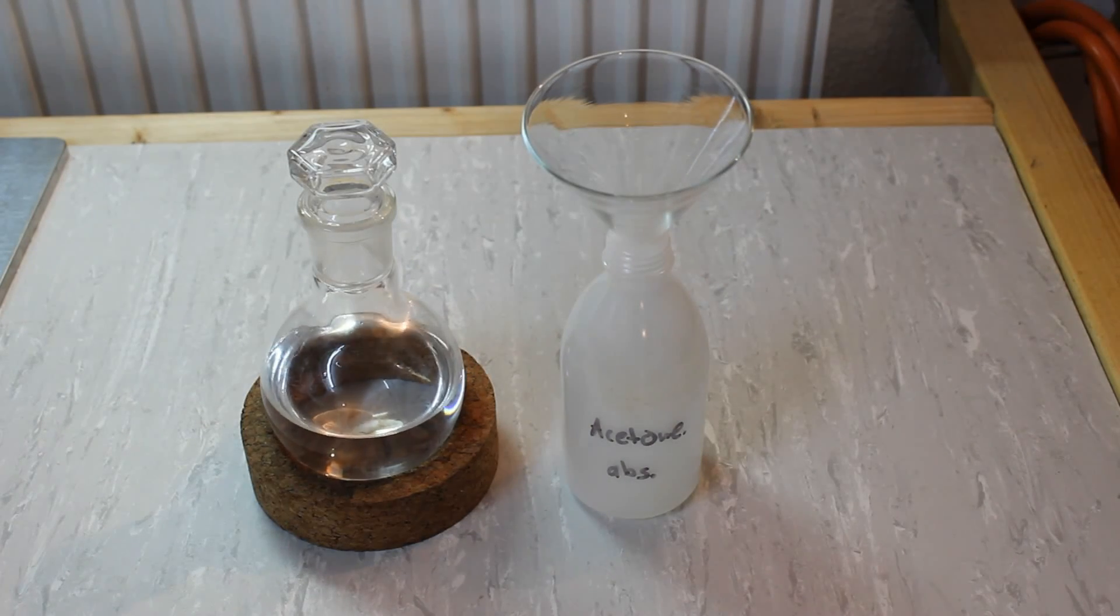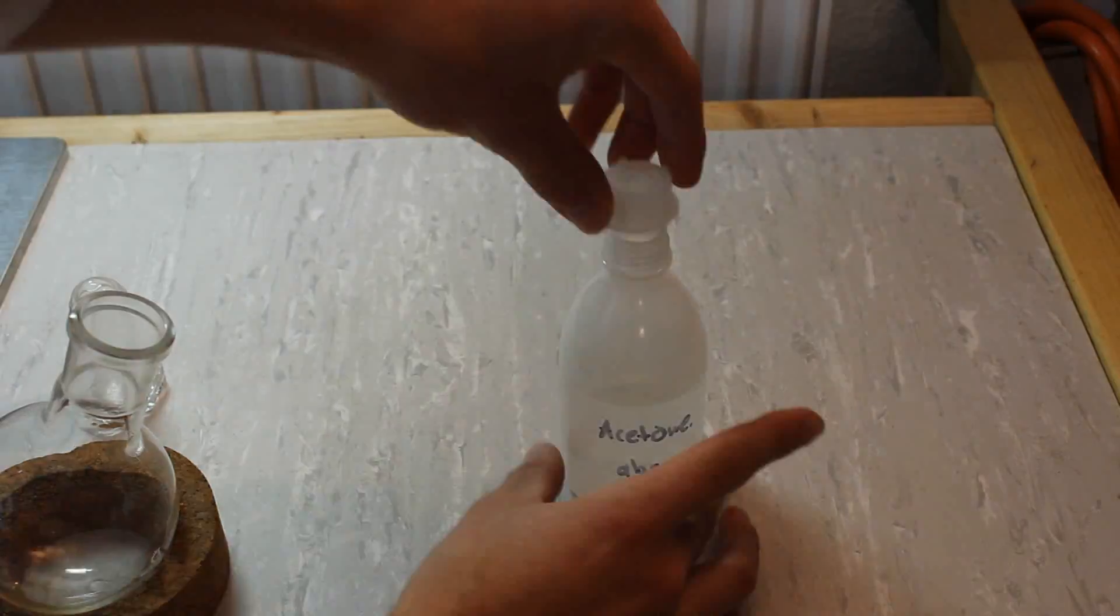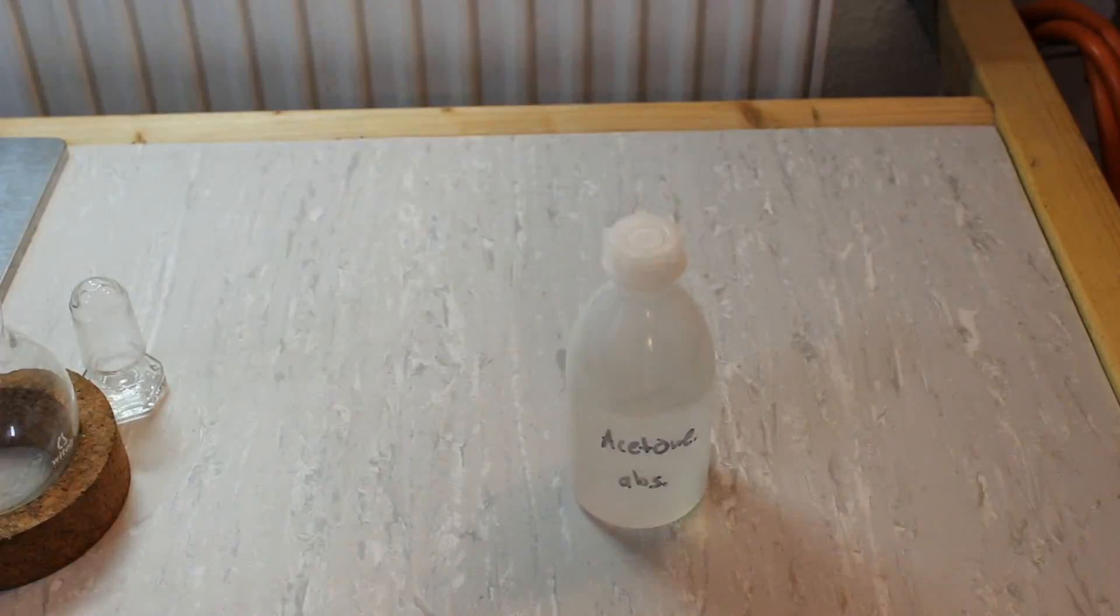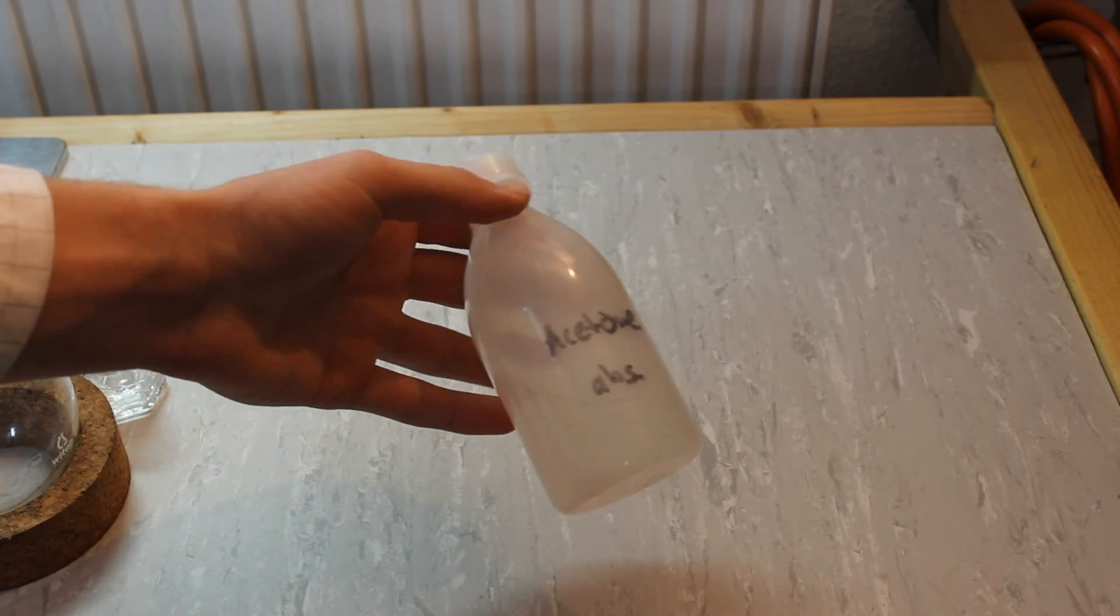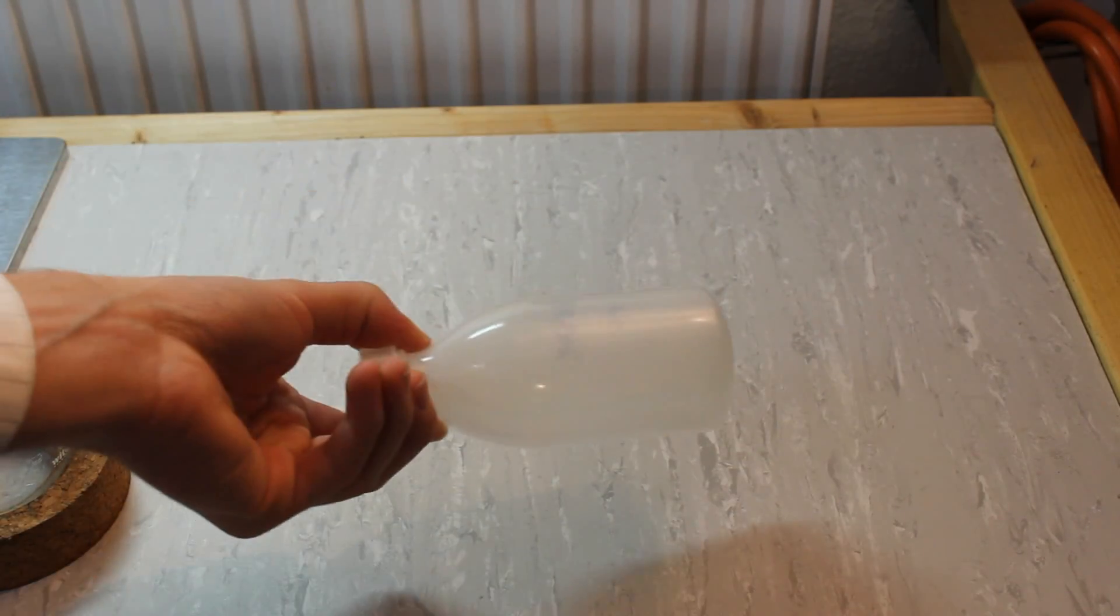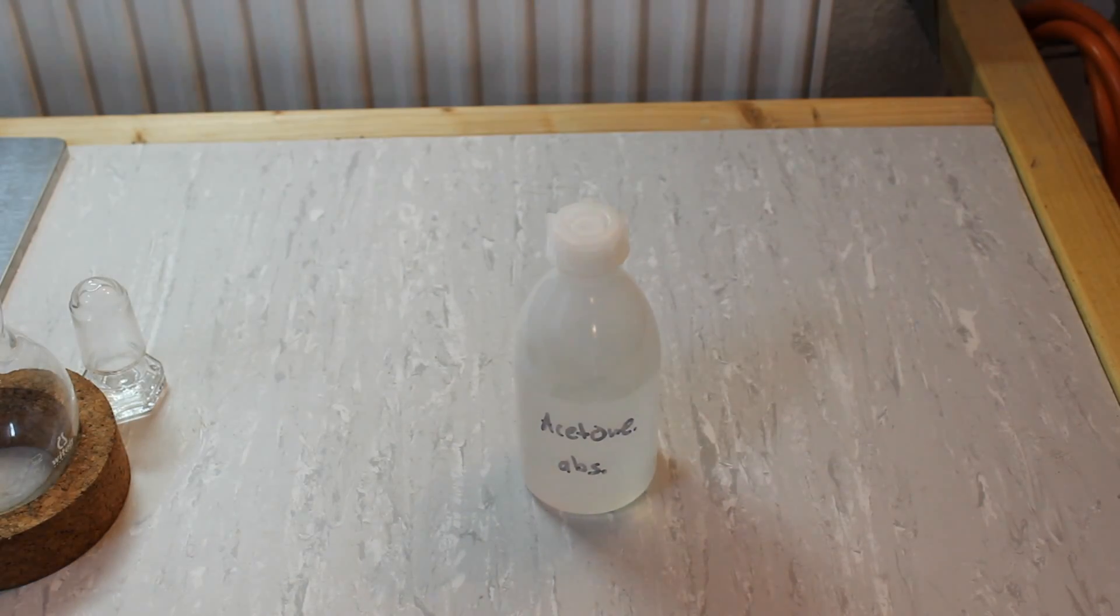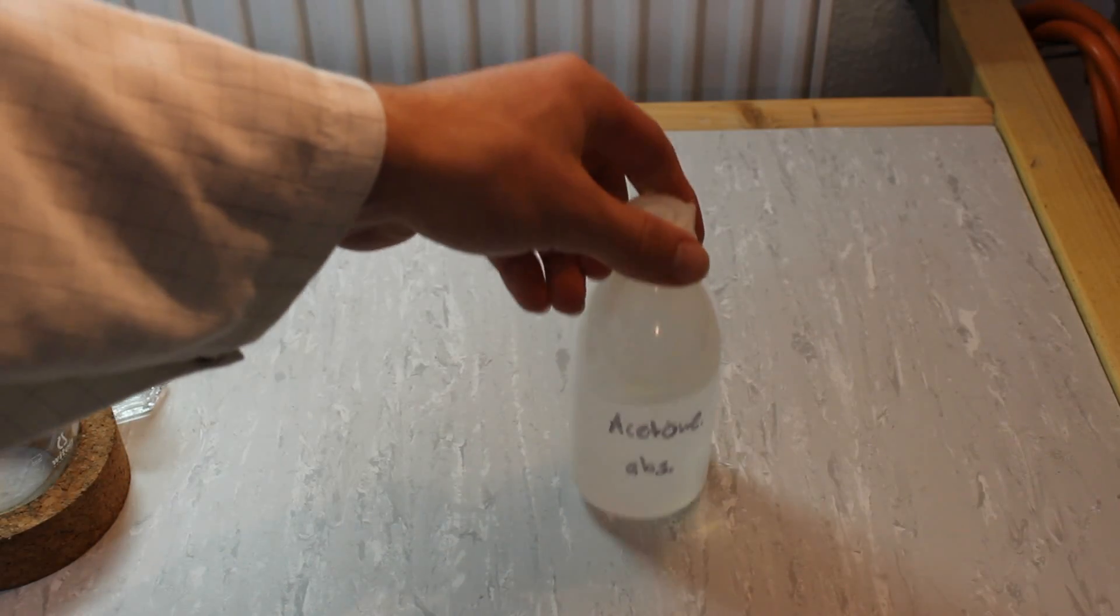Last but not least, I transferred the acetone into a proper storage bottle. So here we go, that's our final yield of dry acetone. I guess this is probably like 200 milliliters, so we did lose a little during the distillation steps, but therefore our product is pretty pure.